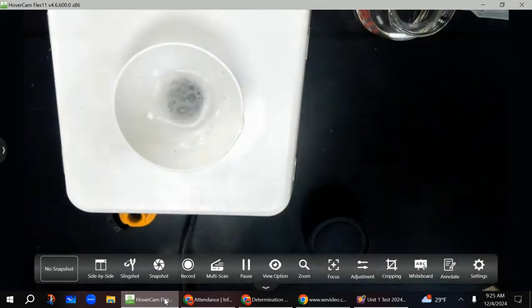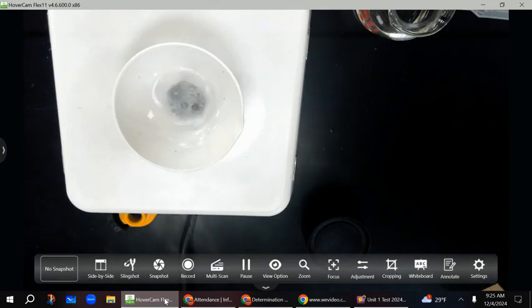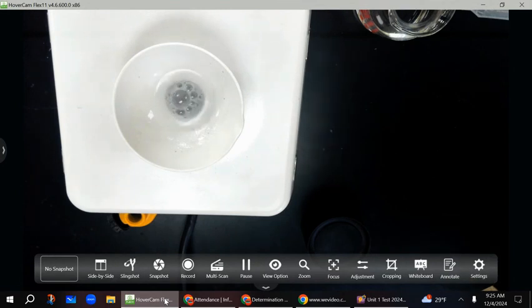And when I'm adding it, you'll notice I'm squirting it right at the zinc to get it to move around. That will speed up your reaction. Because right now, until this all reacts, you can't do anything else. So again, it's starting to slow down.